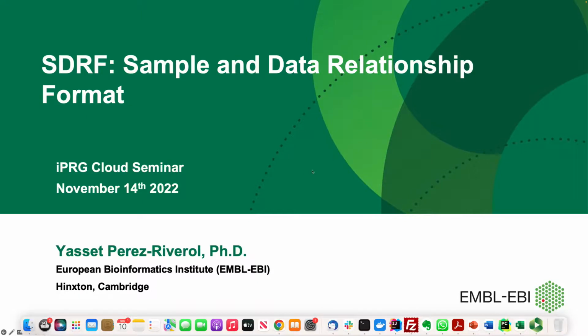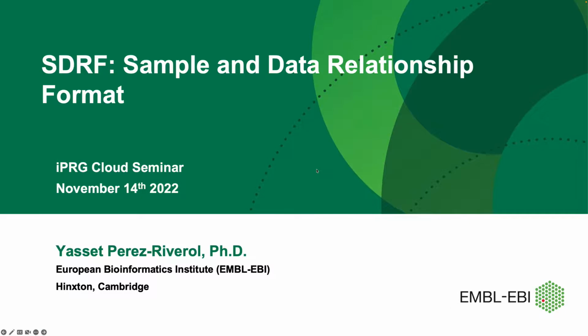Good morning or good afternoon, everyone, whoever is looking at this short talk, which is associated with the main course about analyzing data in the cloud or in distributed compute environments using Nextflow with Quantms. This talk is only about the configuration file, the main file we use to launch our pipeline and describe our data. My name is Perez-Riverol.